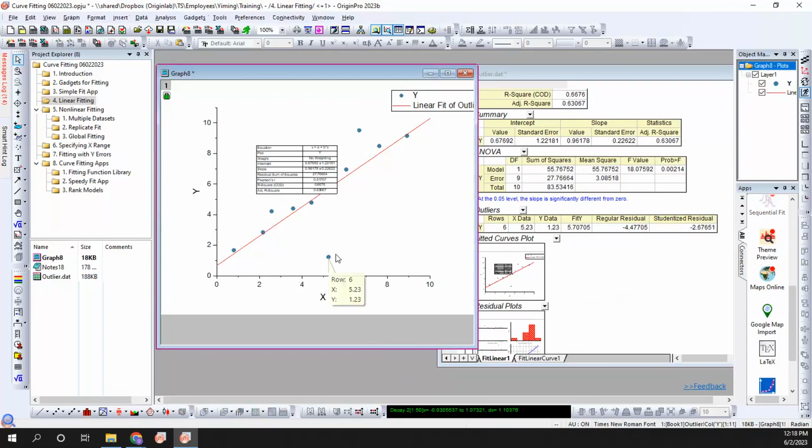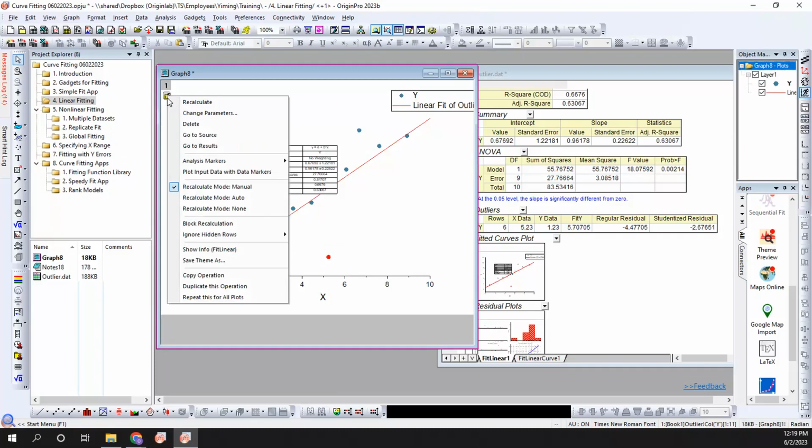I can neglect or cancel this data point in order for the fitting to be improved. If I go to the left-hand side, I will choose Mask Points on Active Plot. When I mask a data point, it will be excluded from the analysis. Let me check the pointer, and you see this lock changes color to yellow, which means the original data of this analysis has been changed, so the calculation needs to be recalculated.